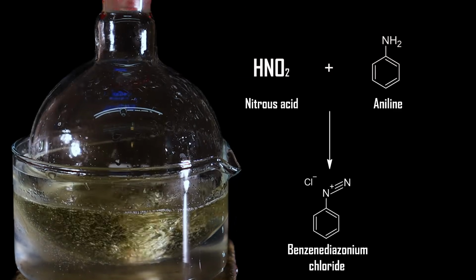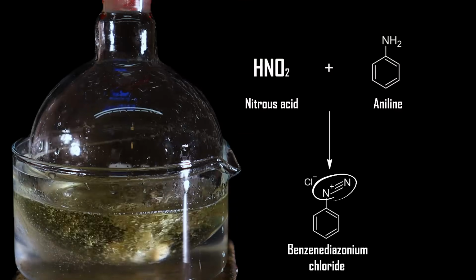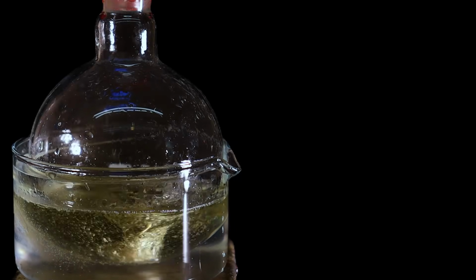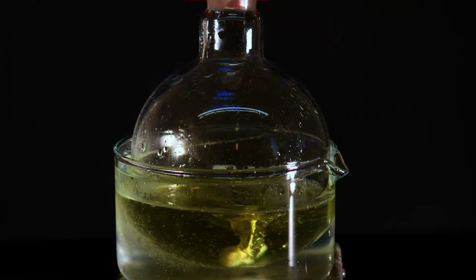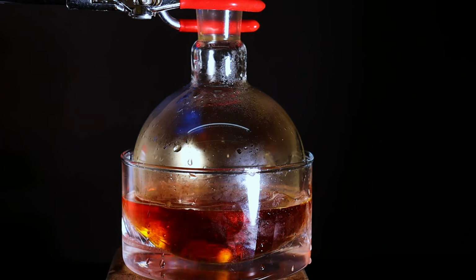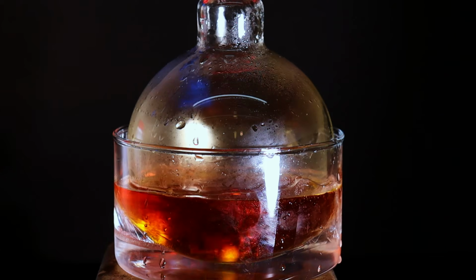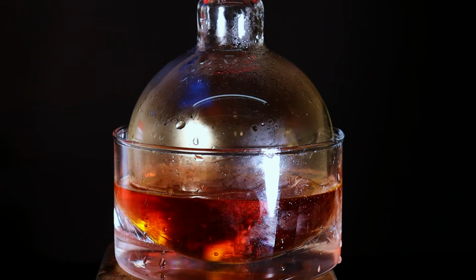You can see that it is quite cursed, and that double nitrogen group makes it extremely reactive and quite unstable. It is especially sensitive to temperatures above freezing, so that is why the ice bath is mandatory. Anyway, I now have to leave the reaction mixture stirring like this for roughly an hour to ensure that everything has reacted. After an hour on the ice bath, it is ready. And you can see that it has changed color. This all indicates the progress of the reaction, and it is time for the last step of the synthesis.